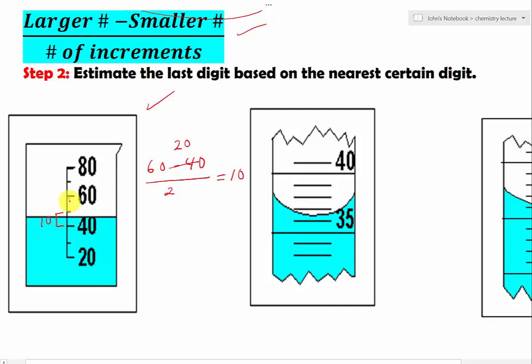40, 50, 60. So let's read this measurement. We know for sure it's going to be 40 something. So let's put 40 right there. We can prove that it's 40 something. But here's the tricky part.